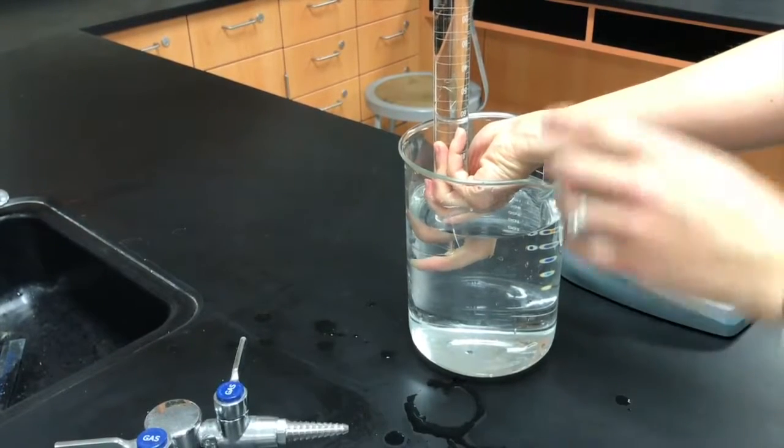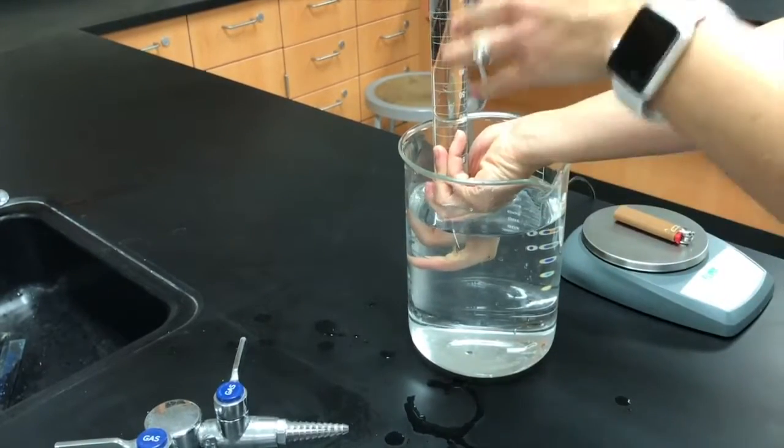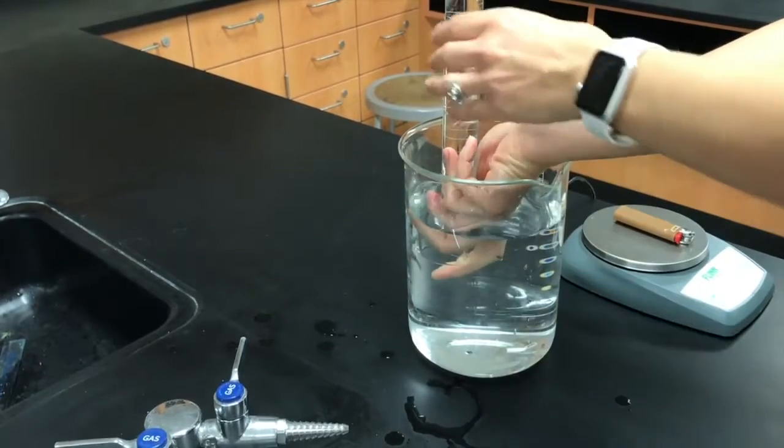All right? So the main point is when you're inverting, put your hand over the graduated cylinder, flip it, and yeah, you're going to splash some water over the place, but that's totally fine. That's what happens in a lab.